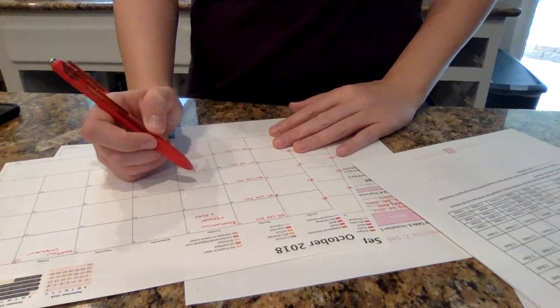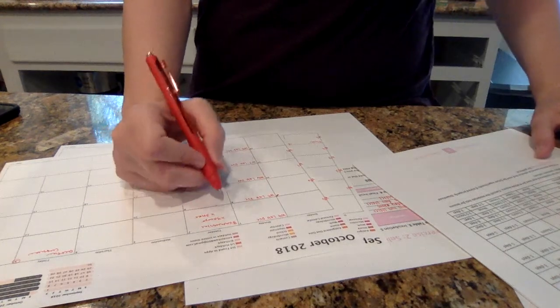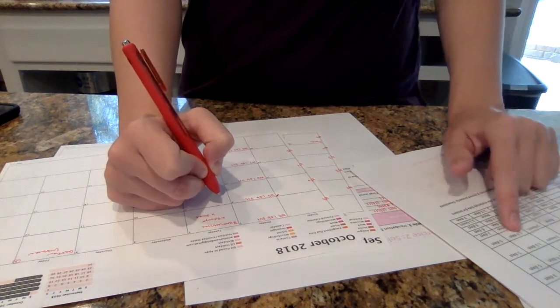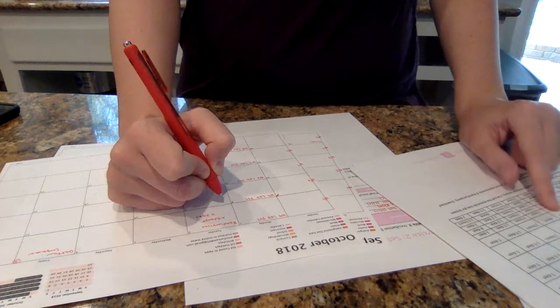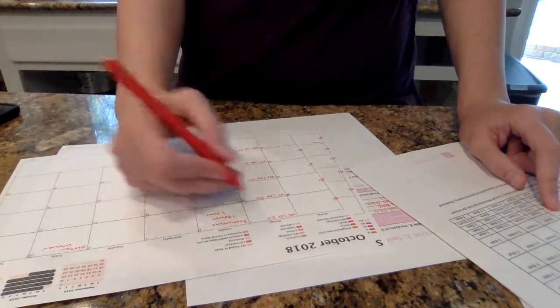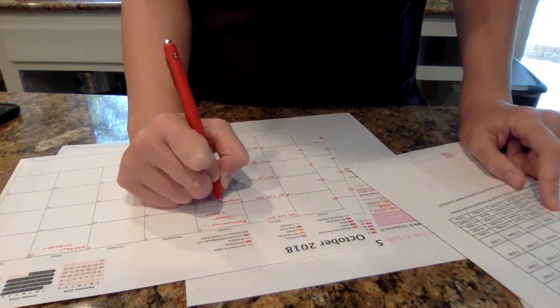Now for week 6, I'll be doing environmental influences. There's 1 to 3 days of active culture, no plate pouring, a 3-hour active time, 1 to 3 days in incubation, and it's a 5-day total. So it's going to be just like week 5's lab. It's basically exactly the same for timeline.